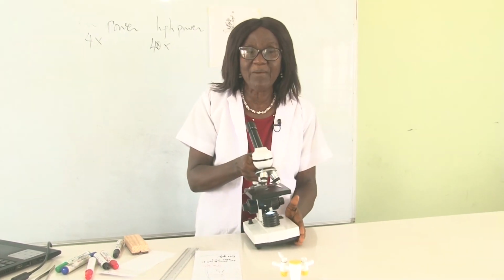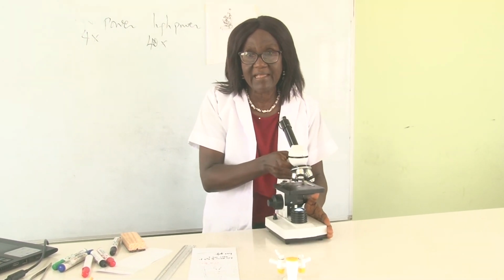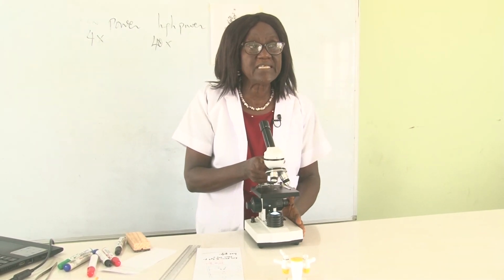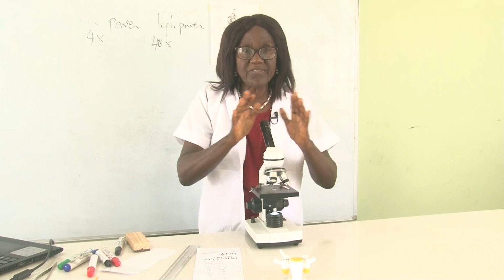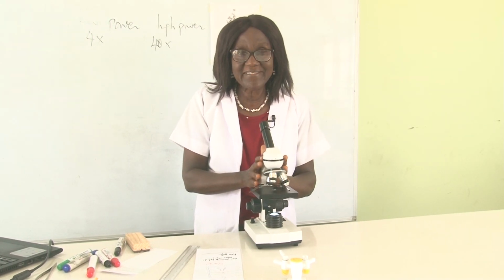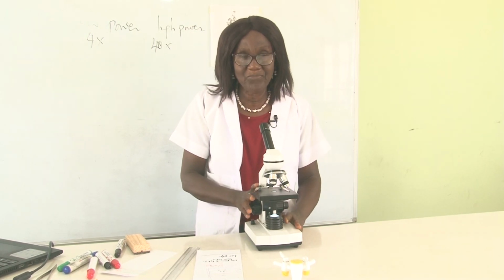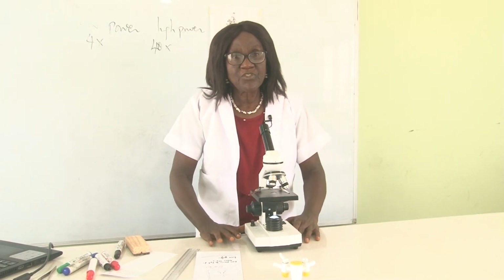Hold it to move the microscope from one place to another. Then also, the microscopes should be protected well, kept in boxes so that dust will not get in. So the microscope should be kept away from dust.